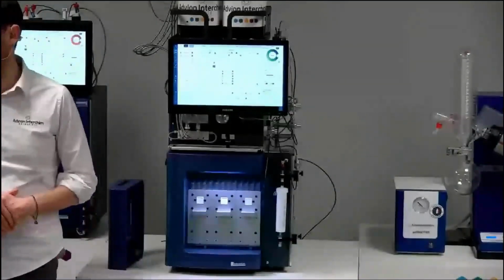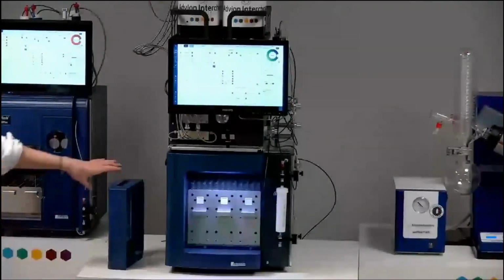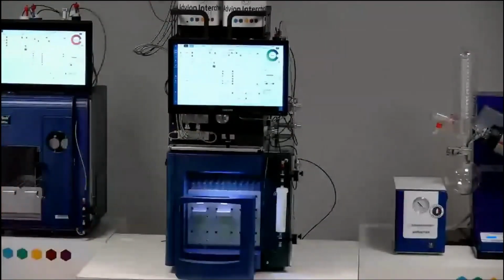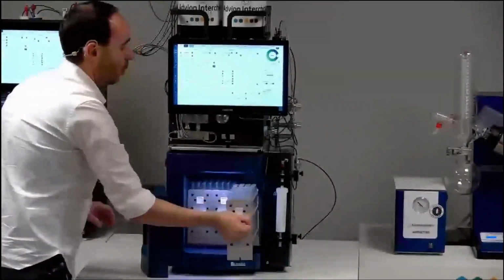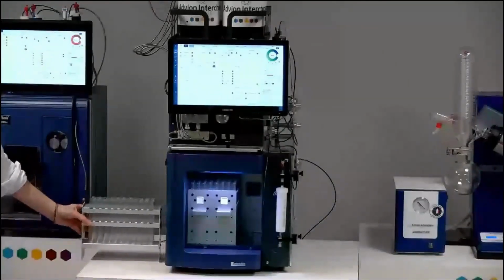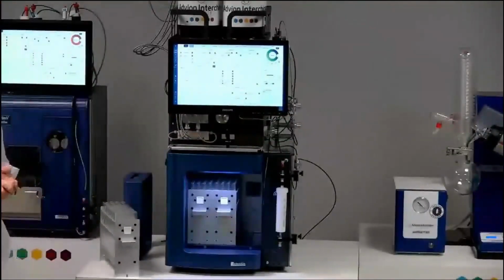This question says, is there an automatic injector? Yes, it's also an option. It's a peripheral. We can have an auto sampler that we can put on the left side of the system. And we put on this auto sampler directly a rack with your tubes like this. You can put on the auto sampler to manage automatic injection. And the objective of this auto sampler is just to fill automatically the loop installed on the system.